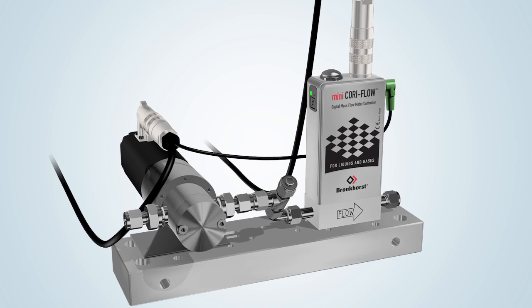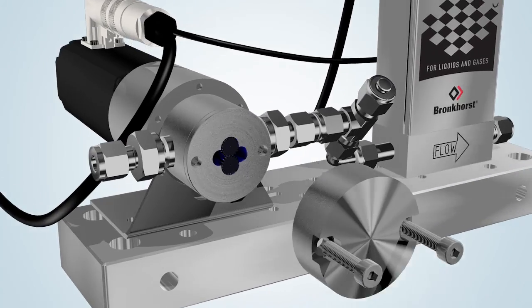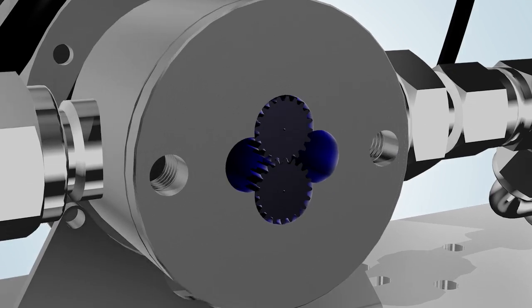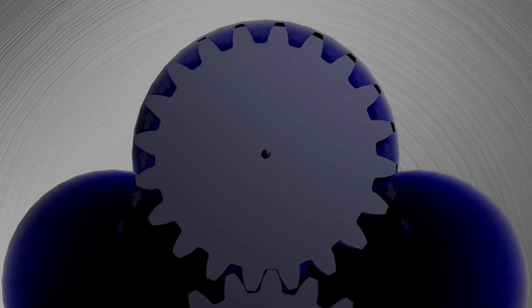The hood of the pump, which is available in stainless steel or Hastelloy, conceals two gears which sit underneath. The space between the cogs is filled with liquid. The speed of the pump depends upon the required flow.